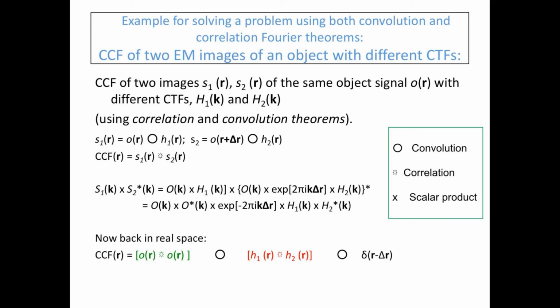Now look at this. What does it mean? The object itself is an atomic object, which when you perform the autocorrelation function, you get a huge contribution exactly where it's at zero. So it is almost like a delta function on this scale. So it's a delta function convoluted with the cross-correlation function of the two point spread functions.